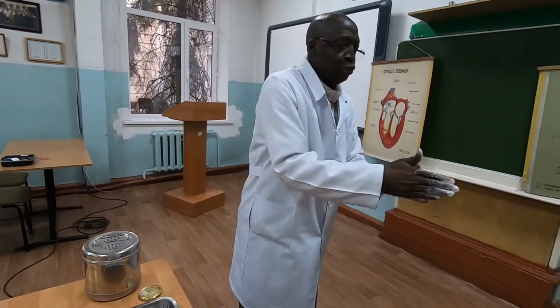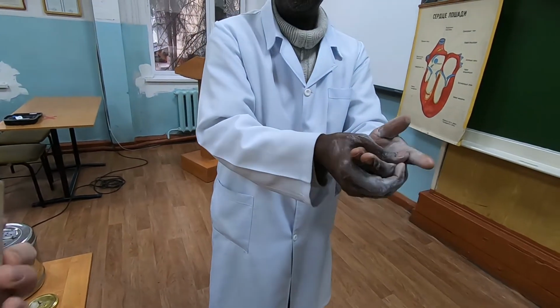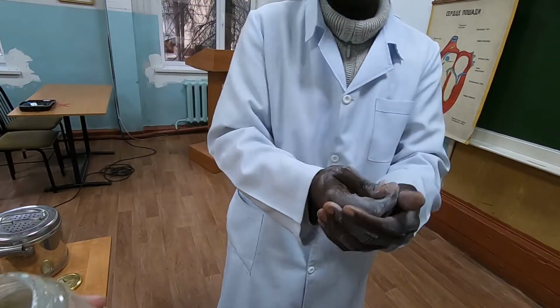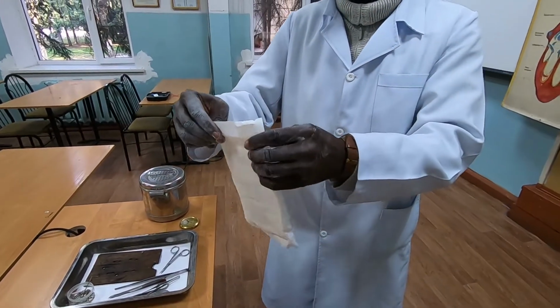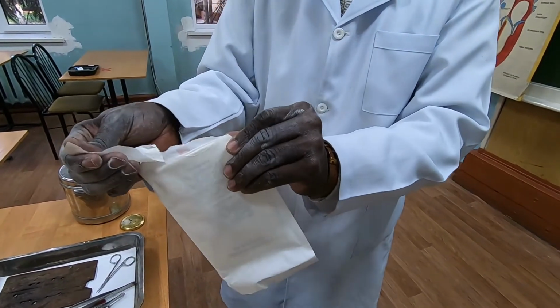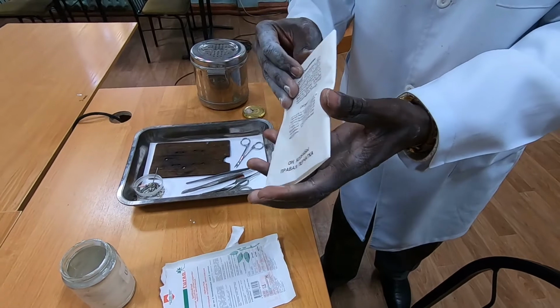To start our work, we have to use special powder, okay, to rub it in our hands. So this is what we call the special powder. In Russian language, we call it talc. Why do we use the powder? To make it easier for us to use our gloves.